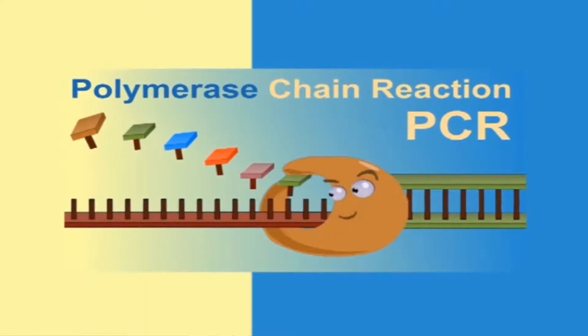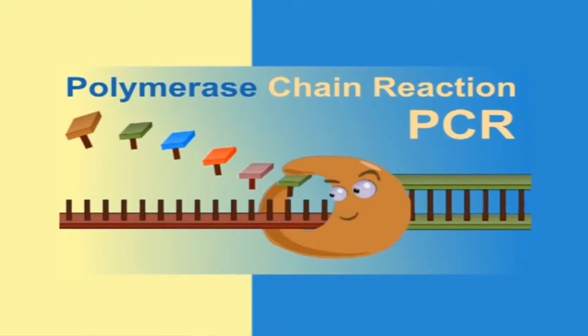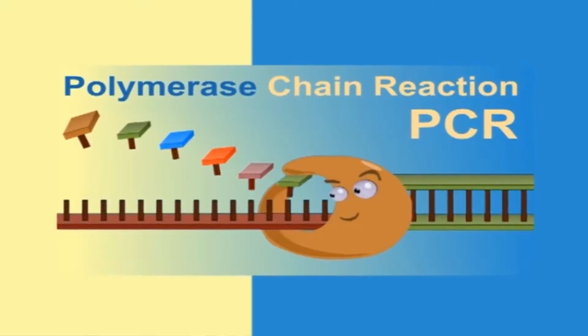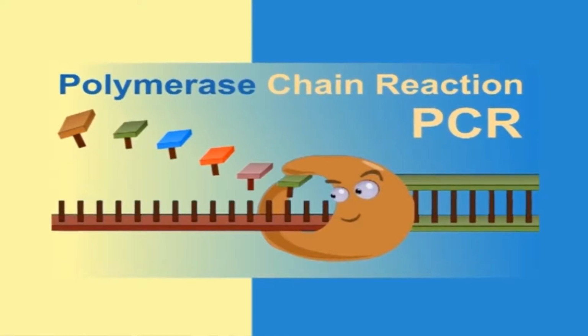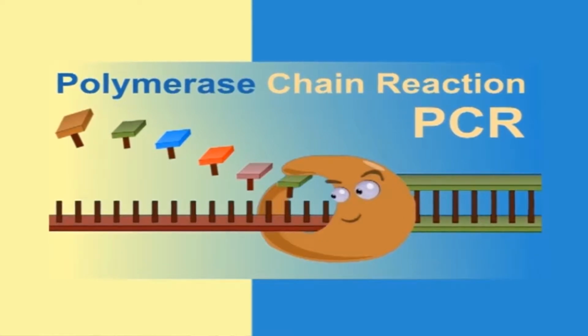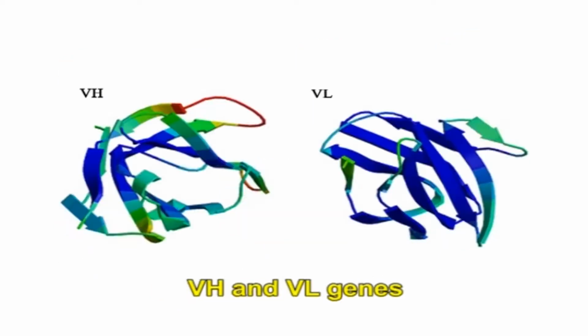Using universal primers through polymerase chain reaction, or PCR, the VH and VL genes for antibodies can be amplified. In PCR, by building restriction sites into the primers, cloning and expression in mammalian cells or bacteria can be done directly for the amplified VH and VL genes. The hybridomas or B cells that are homogeneous or heterogeneous may be used as a raw material for PCR. Later, a variety of VH and VL genes will be amplified and combined at random to develop as many as 10^6 clones for the antibody genes.